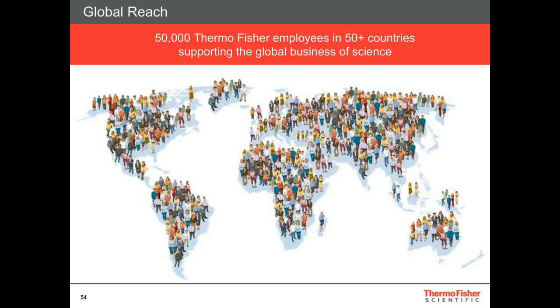How does the peak shape of the early eluting pesticides look, for example, the Acephate or chlormequat? Katerina, could you answer that question? Yes, I'm happy to answer this question. Thanks to the very low injection volume, only 1 microliter, we have very good peak shape even for these very early eluters. We made some tests, and with high injection volumes, like 3 microliter, the peaks were tailing and the peak shape was unacceptable. But with 1 microliter, everything is fine.